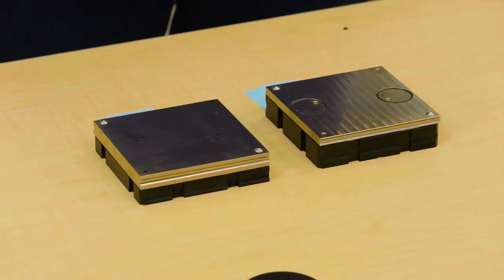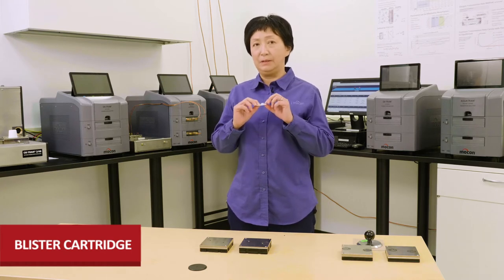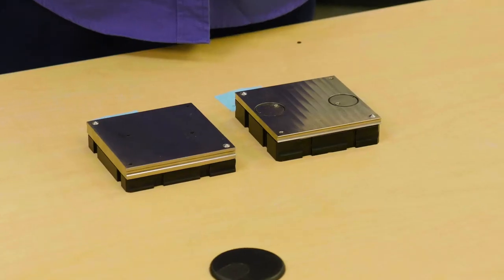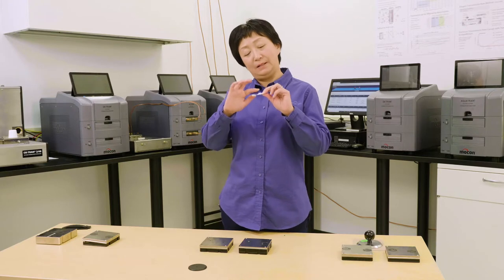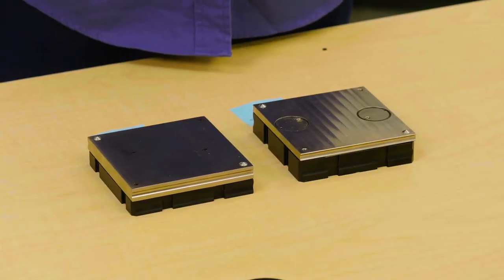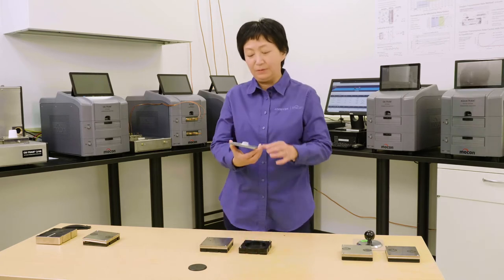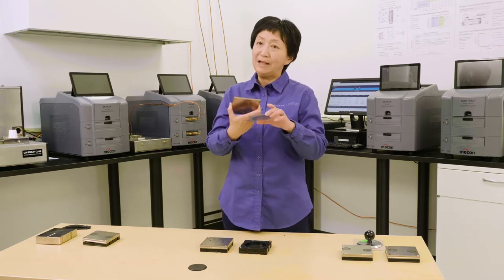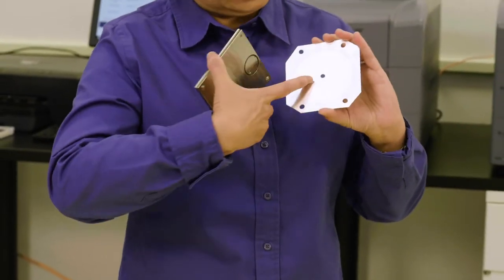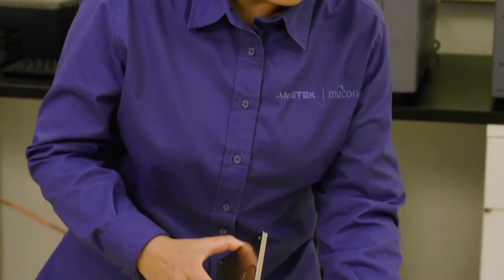Next, we'll talk about the blister test cartridge. A lot of times we want to test sealed blisters as a package, and they are usually small. For different purposes, sometimes you only want to test the dome of the blister. In that case, we can epoxy it onto a foil mask with a small hole, so you can use it like testing a film. This is one way for testing the dome side of the blister.